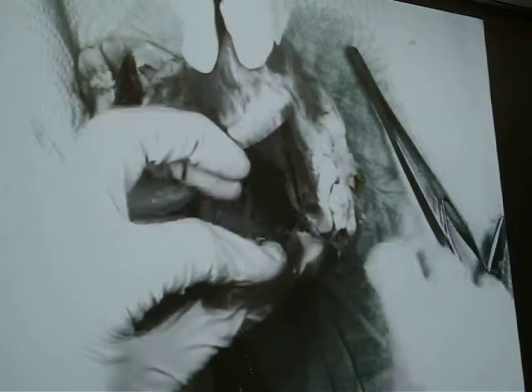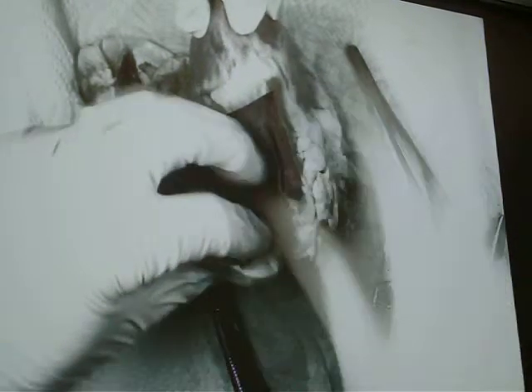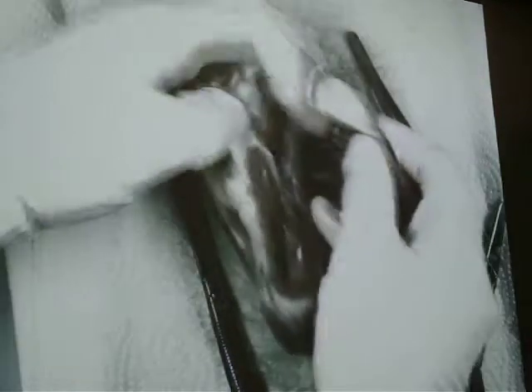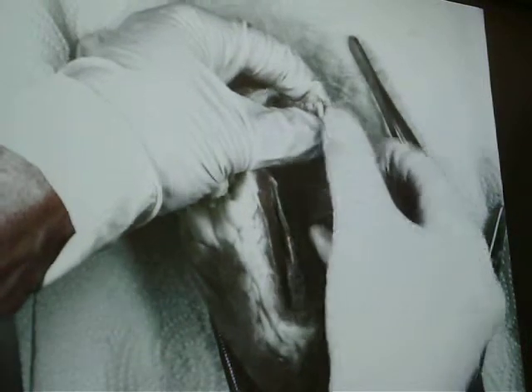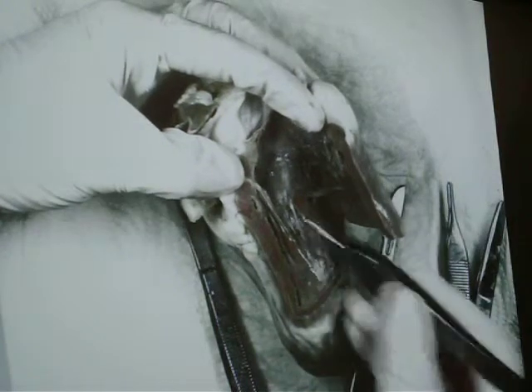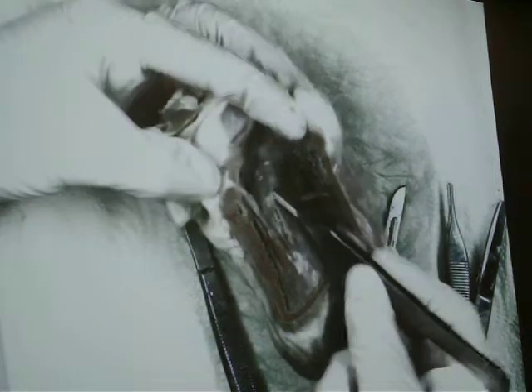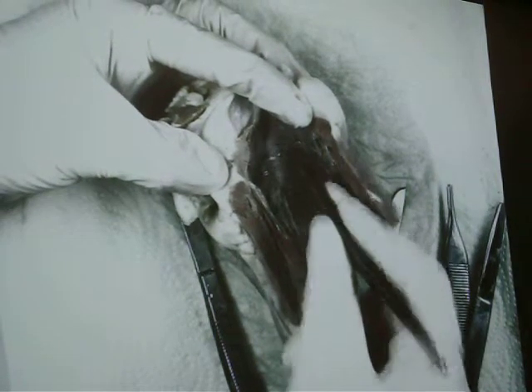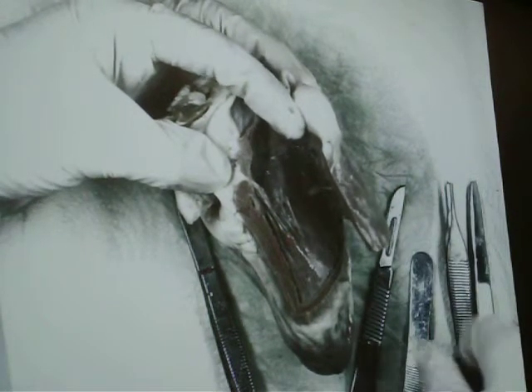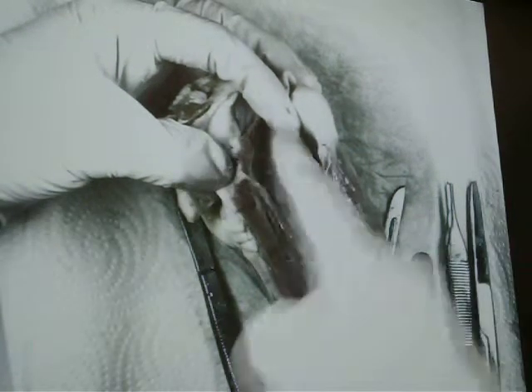A little bit further down — I'm going to rotate that slightly and come up a little bit higher so we can see better. If I can orient it right-side up, the view is a little bit better. Look how much fat there is on this part. So we have right ventricle, tricuspid — the right AV valve — there's a flap of it. And up here we have the right atrium. What major blood vessels are draining blood into the right atrium? The vena cavae — cranial and caudal vena cava. Let's see if we can find those; stick our fingers in and poke around. That's the fun part.